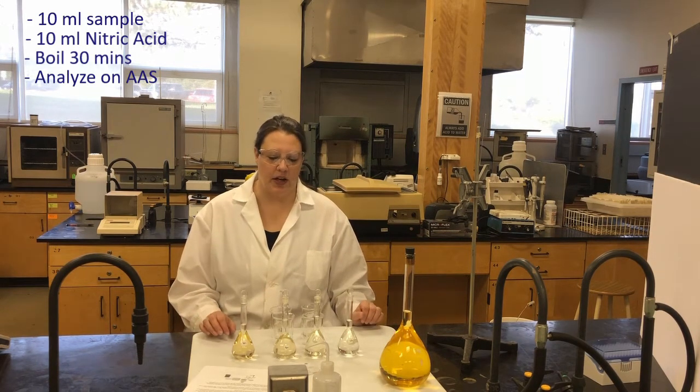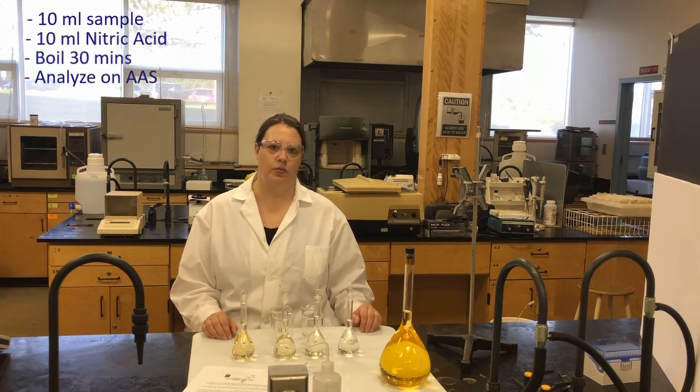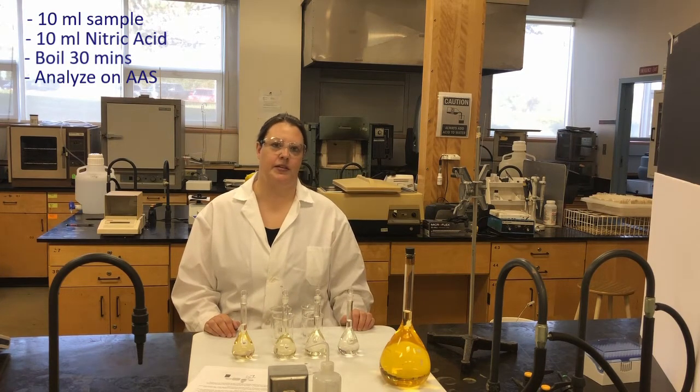So we're going to start off first by doing our sample prep. We're actually going to do that in the fume hood because we have to add concentrated nitric acid. So we'll take our samples over to the fume hood and get them ready there.